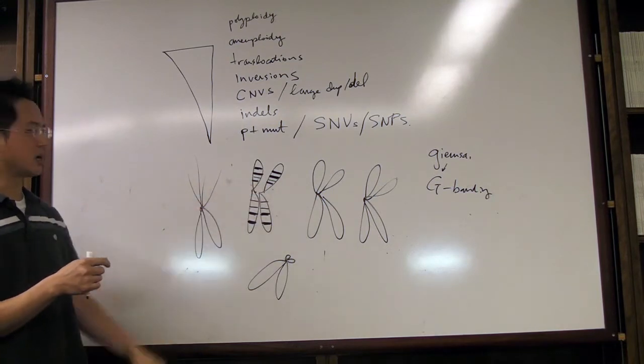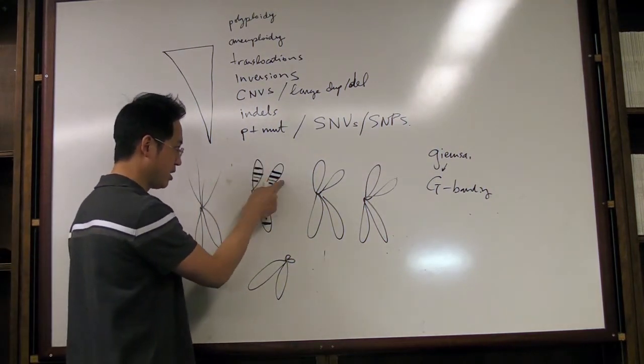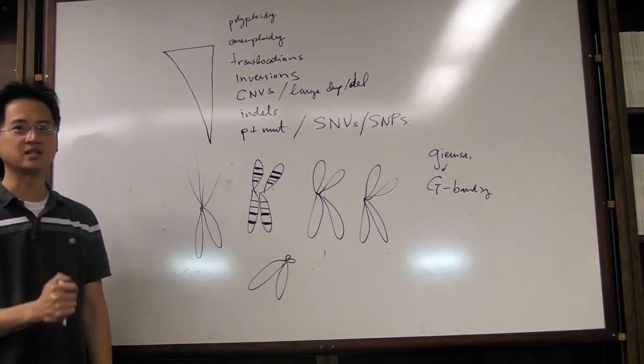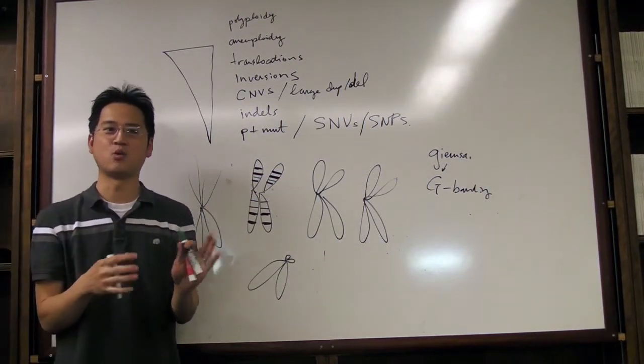based on the banding pattern, they can tell you, yep, that's chromosome number 2. And in fact, they can tell you that's chromosome number 2 and that's P21.5 or something like that. That's how good they are. And that's how bad we are, because we, for the first time, look at this, we have no idea what it looks like and what it means.